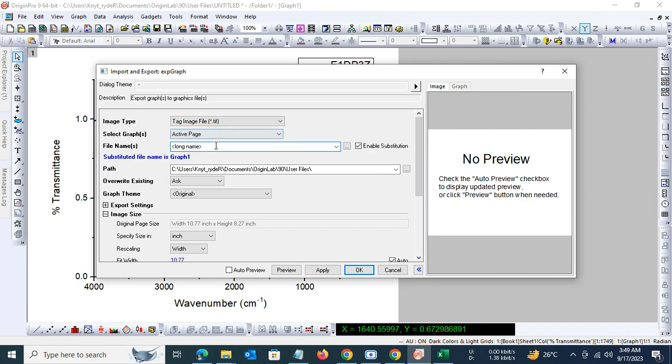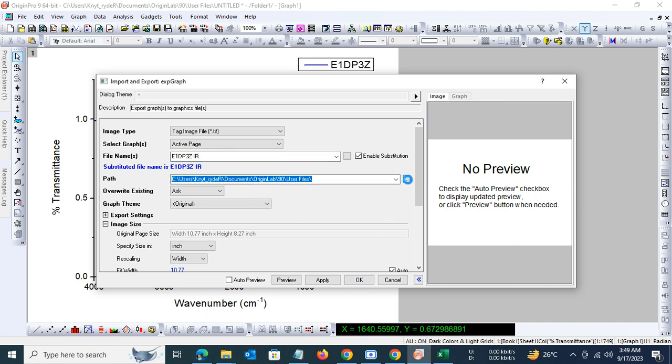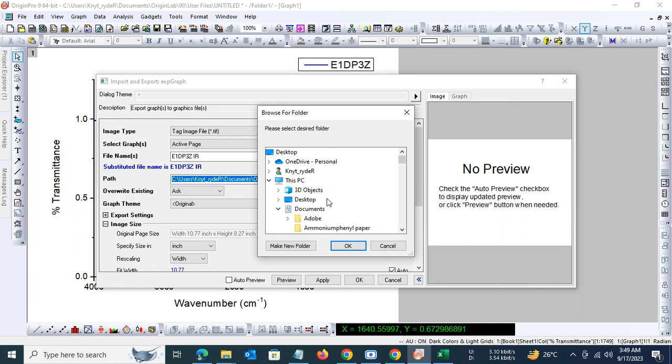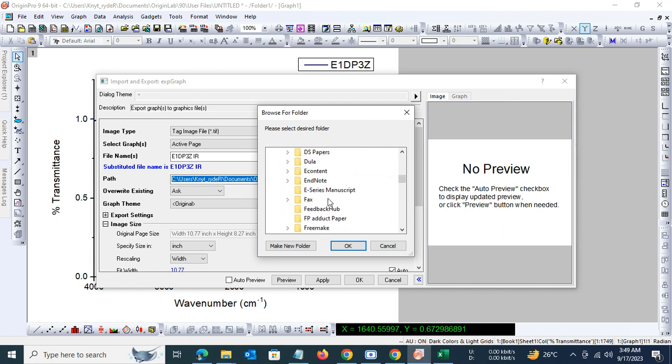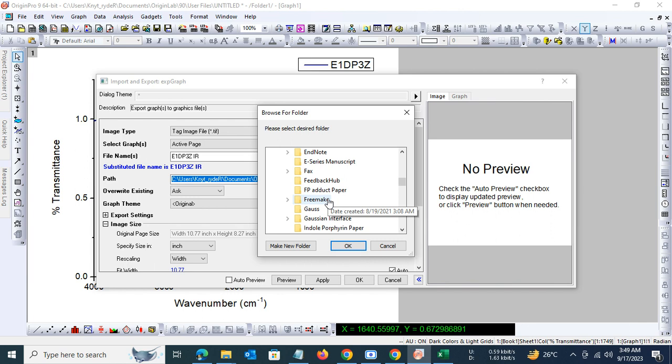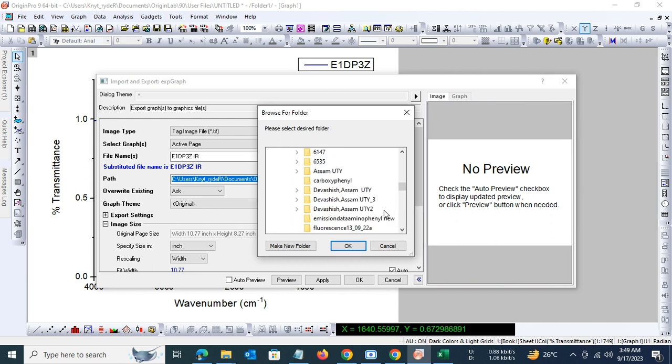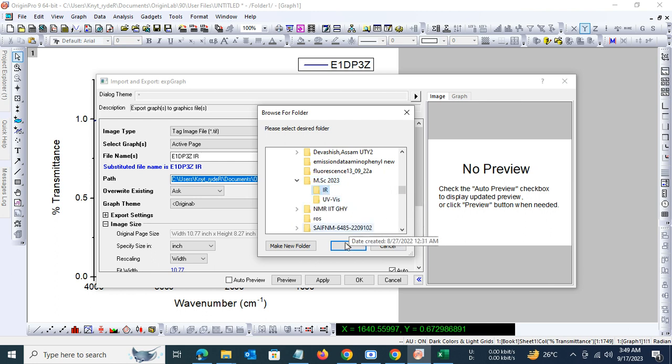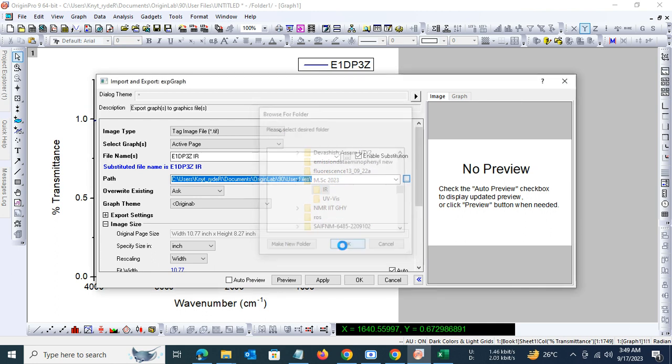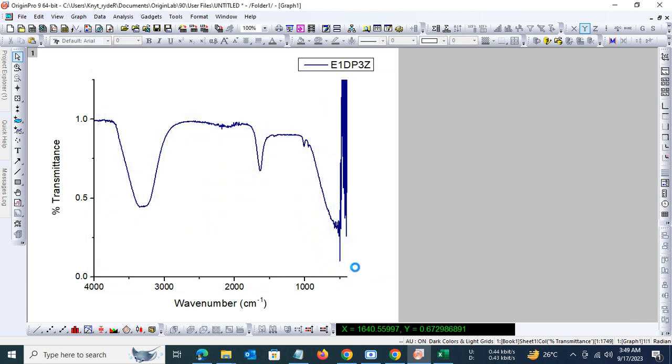You can name the file here, so it's E1BP3Z IR. Let us define the path here. Let us click on okay. So that's it.